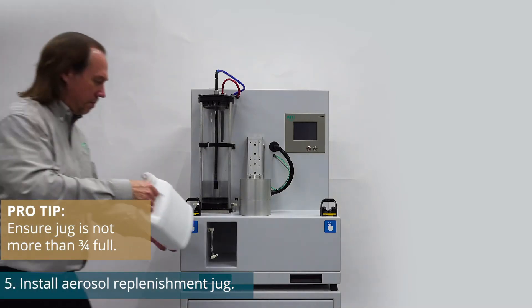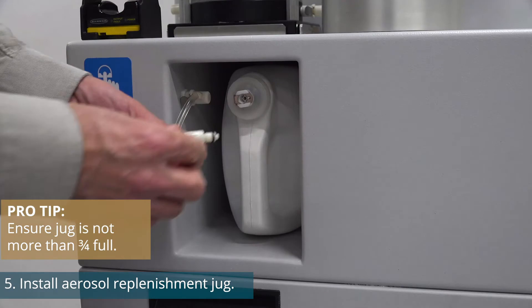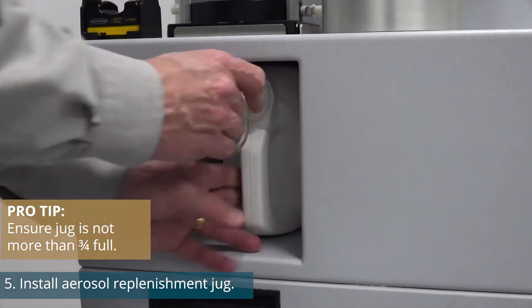Now let's install the aerosol replenishment jug. Ensure that the jug is no more than three quarters full. Note: the proper cap with fittings must be used.